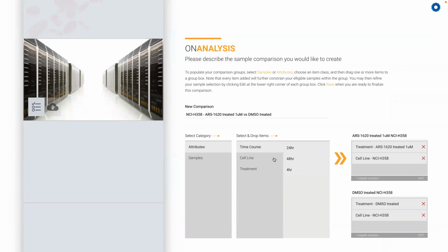So we've got a good apples to apples. And I probably want to pay attention to time course. So let's make sure that we do 24-hour. And sure enough, now we're down to 24-hour. Couple more points to emphasize. Control is always on the bottom. It's incredibly important to mention. That does affect directionality when looking at your results. The results will be the same, but what's up, what's down will vary. So make sure control is always on the bottom, treatment is always on the top.